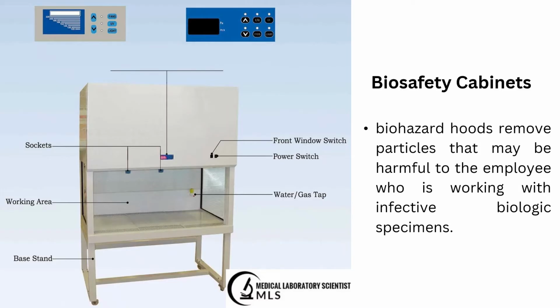This consists of combinations of laboratory practices and techniques. The safety equipment and laboratory facilities are included in those biosafety levels. The biosafety level of a laboratory is based on the operations performed, the routes of transmission of the infectious agents, and the laboratory function or activity. Accordingly, biosafety cabinets are designed to offer various levels of protection depending on the biosafety level of the specific laboratory.